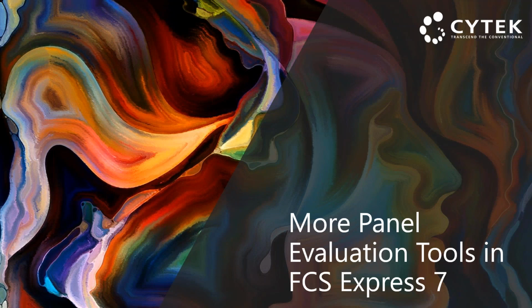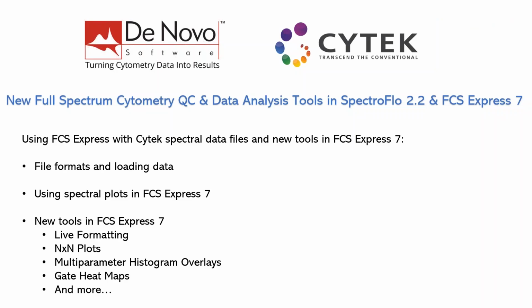Great, thanks Janelle. So I did see we had a few questions that have come through during the webinar. Janelle is going to be taking a look at those while we talk about analyzing some of this data in FCS Express and some of the new tools here. So just hang tight with those questions, and we'll also make sure we come back around to any at the end that we didn't get to answer during the webinar.